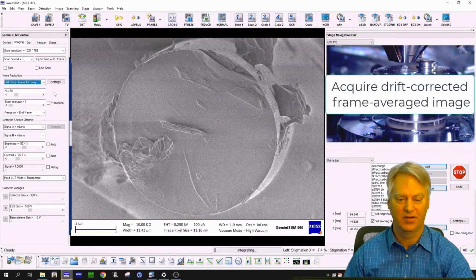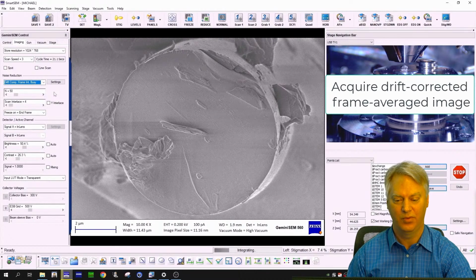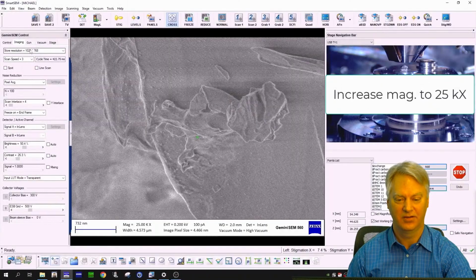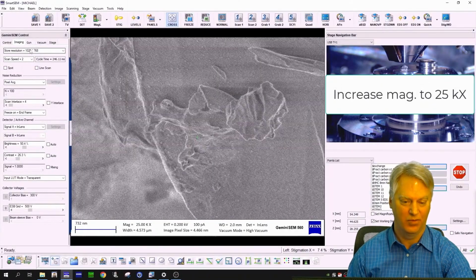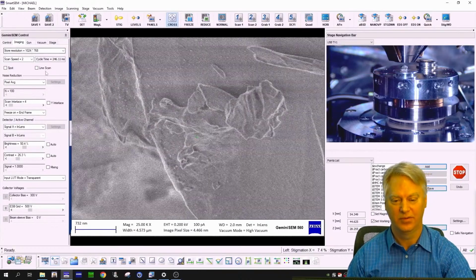So we're in-lens. We see that there's far less streakiness here, so we're not charging nearly as much as we were at 1.2 kV. We have about the same current. I could have dropped the current if I wanted to, but that wasn't the point. It's just showing that even at a very low voltage, we're still encountering some charging effects, and streaking and things like that are not ideal for what we want. We'd like to completely get rid of them if possible.